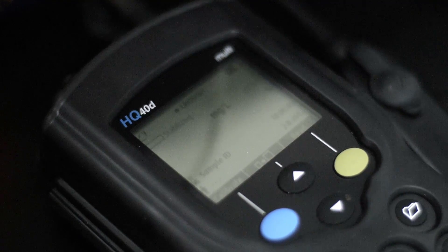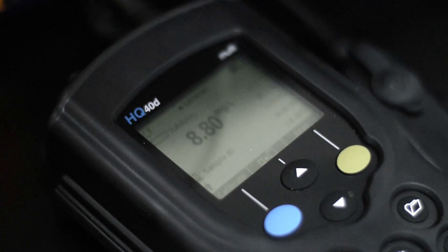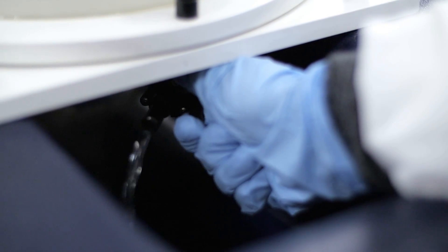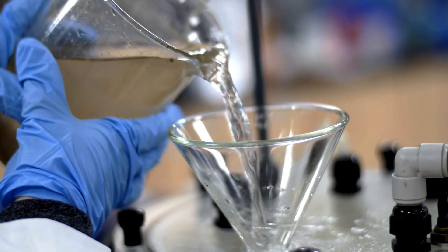To use the reactor, students calibrate oxygen meters on the reactor. They then fill a tank with feed water and prime the reactor by adding water.